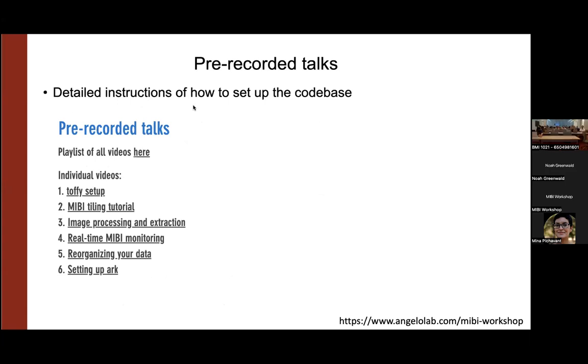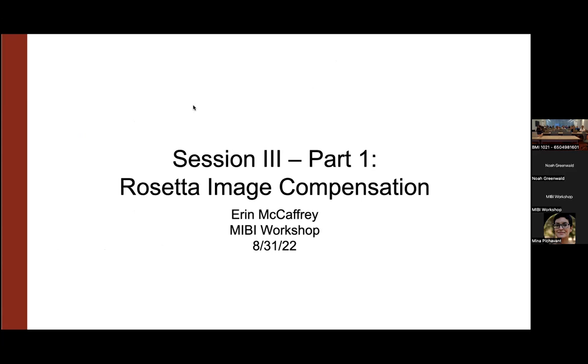We have a talk on installation notebook, doing the tiled runs, all of the sort of QC metrics and extraction and the automated versus the manual workflow. We have notebooks talking about how you set those things up. And then also the final notebook, we also have a little demo of.